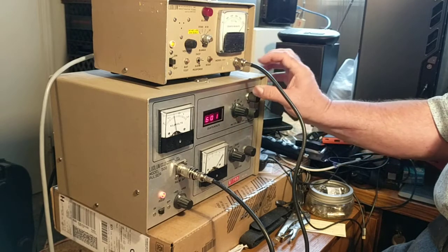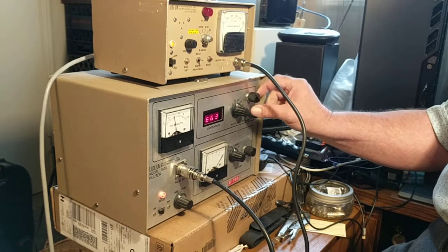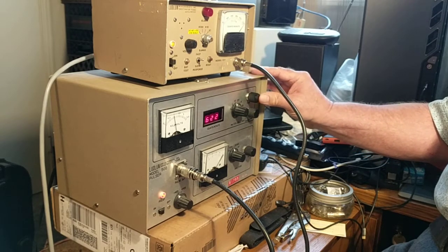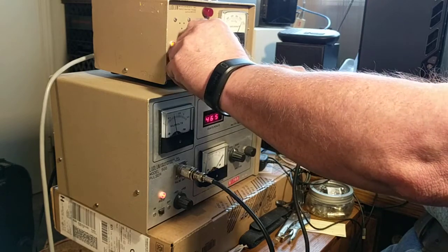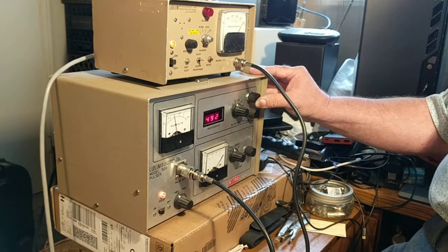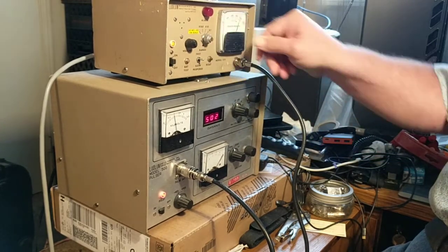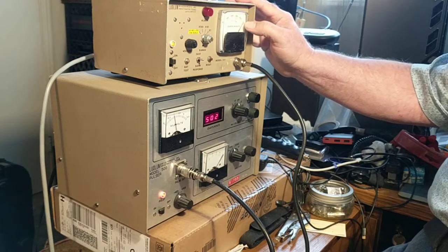It's a very sensitive adjustment; the fine tune is tricky and in some cases you have to go overboard. There we go — up to 500. So this is 5,000 counts per minute now. You can do the same for the other scales. And once again, since this device has been calibrated, we're ready to go.